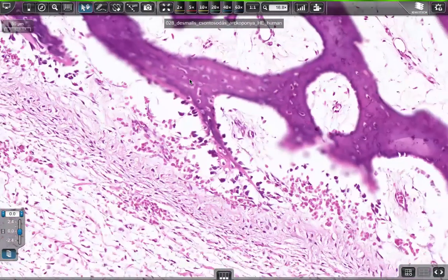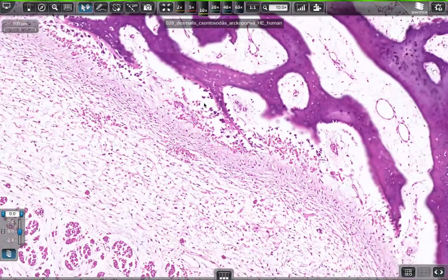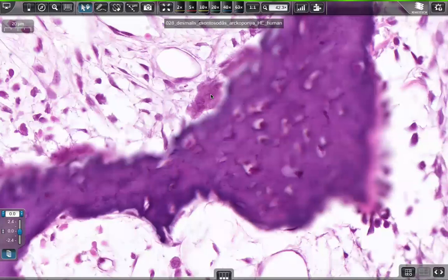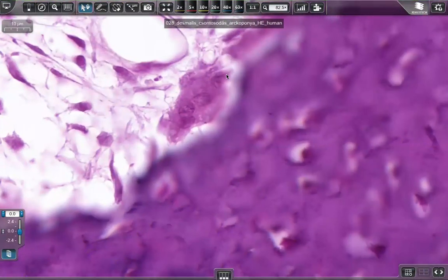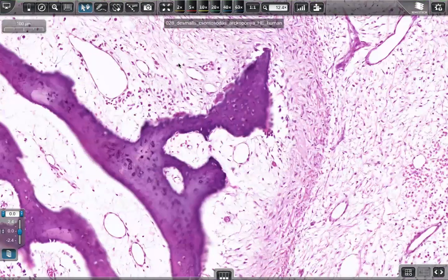To keep up the balance between the synthesis and the absorption, we have another cell type. That's the osteoclast. This is a nice one. Also a multinucleated cell. With acidic hydrolases, they dissolve and absorb the bone tissue, forming the house-shaped lacuna. So there is its own lacuna for the osteoclast called the Howship's lacuna. But everywhere here we can find vessels and mesenchymal tissue.